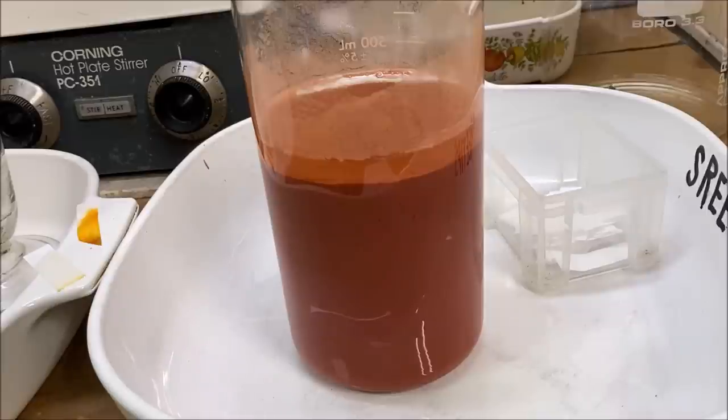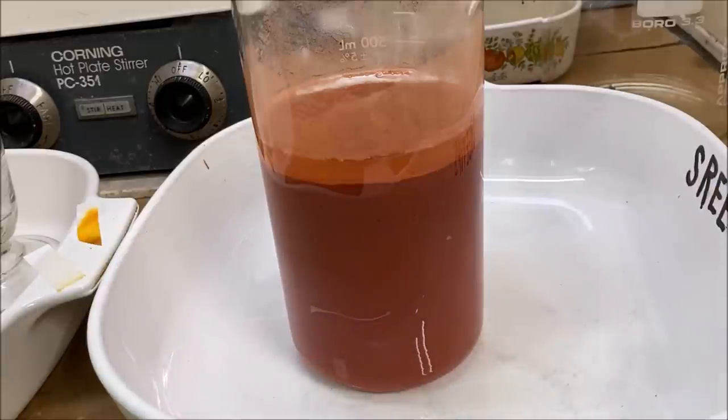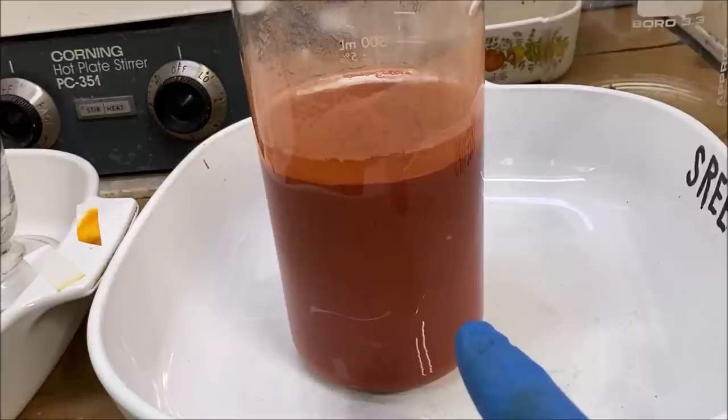This will complete or conclude part one of the platinum refining video. And we'll cover this up and let it settle. And we'll pick up right here in part two.